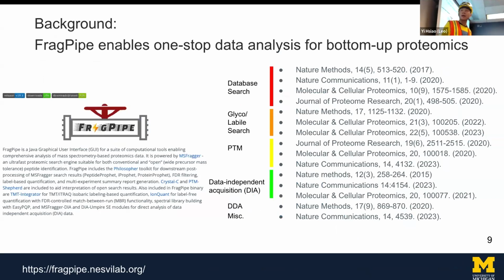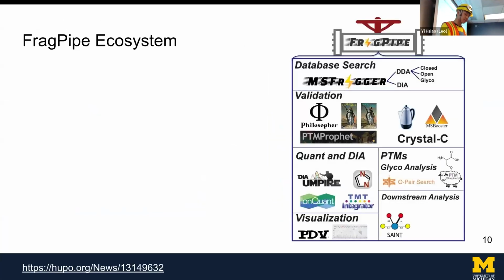So FragPipe, as I introduced in the beginning, we have been working on this for several years, and this software is also being used by many people. I think we can confidently say that probably around 20 or 30% of the users in this field are using our tool.